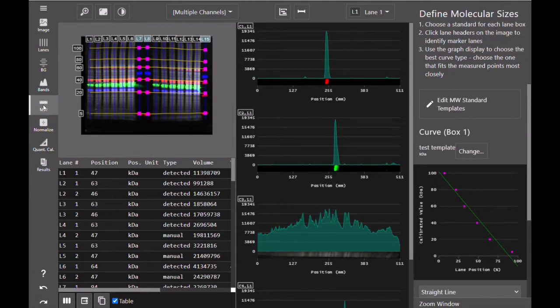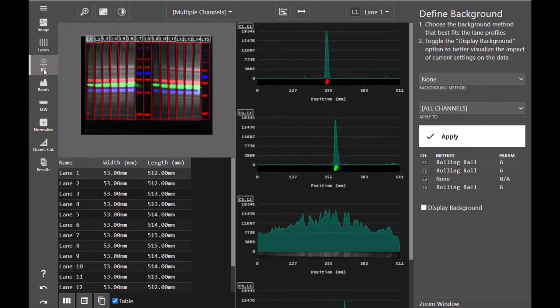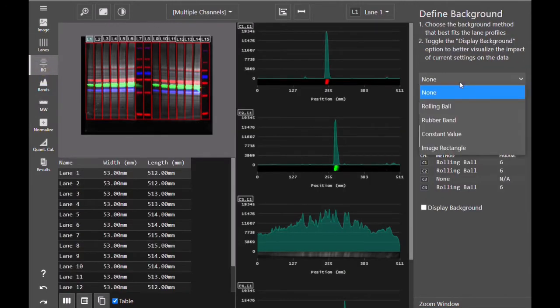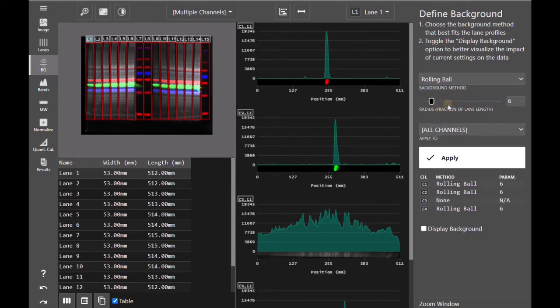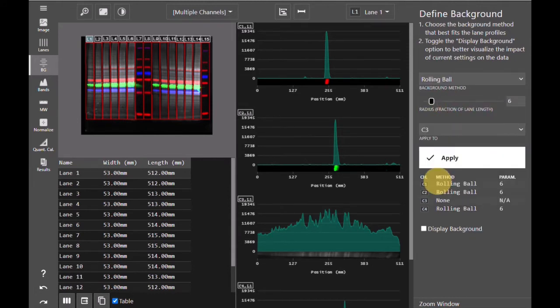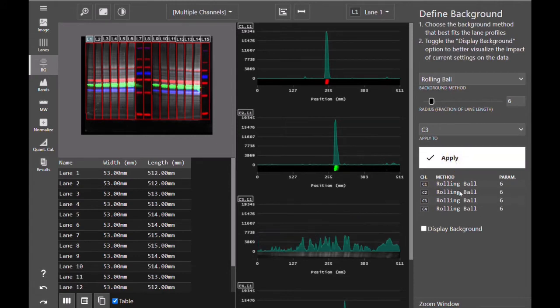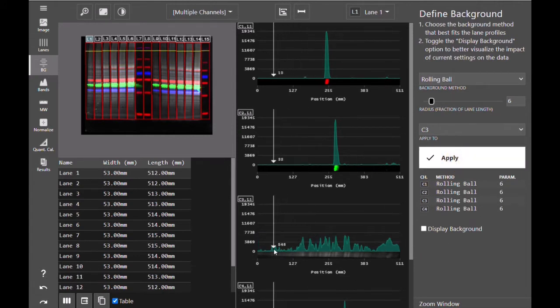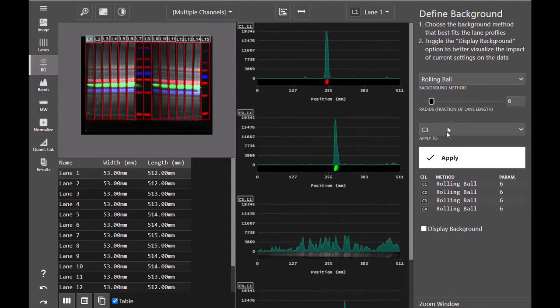So to cover normalization we'll first return to background subtraction. As we explained in our previous video, if you subtract a rolling ball or rubber band from your total protein channel, the majority of your total protein signal is removed and subtracted as background.